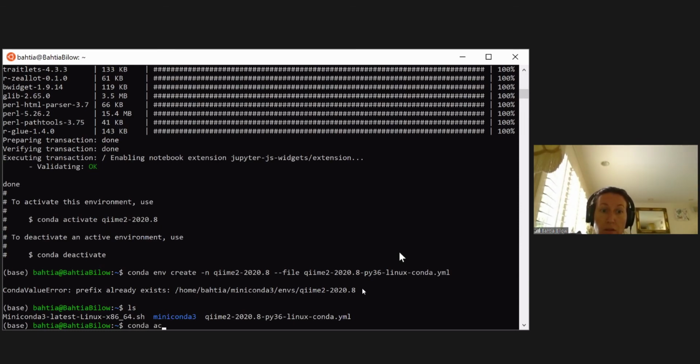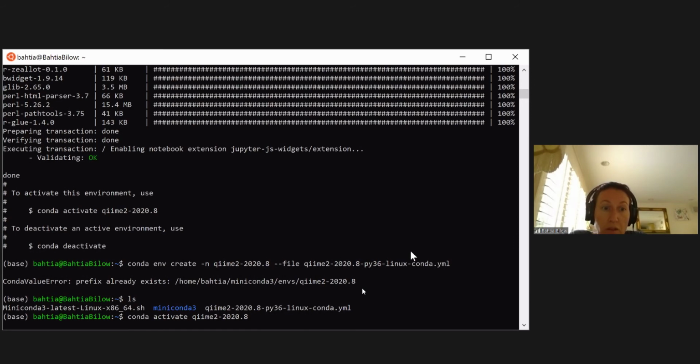Do you see that up there? Yeah. Activate. Then, oops. .8, no pi. Just delete. Yeah, there. Just that? Just that. Okay. Let's see. All right. There you go. So that's good enough for now.